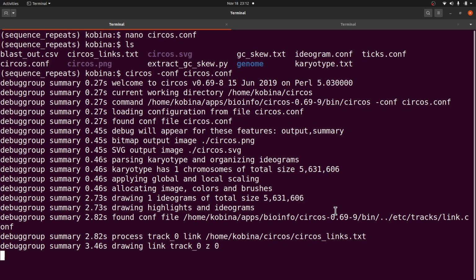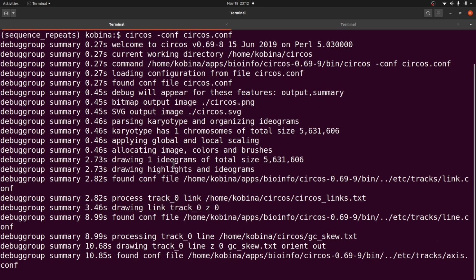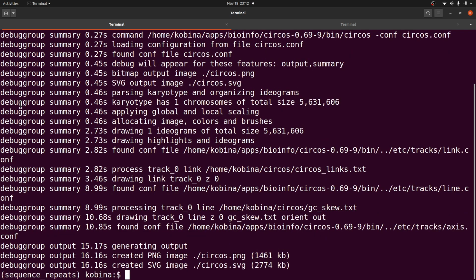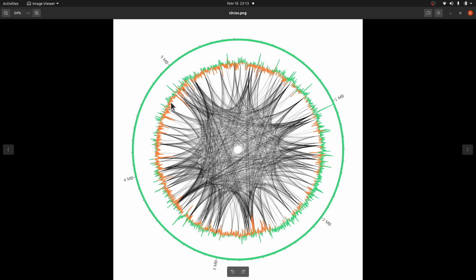So now we are trying to improve it. What we are going to see is this new figure. We can open it and check. Now we see that it's here. It's also very, very nice and lovely. This is now very, very cool. So we have it like this.